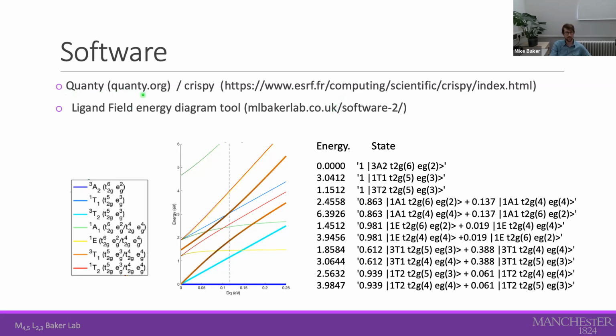I also showed some actual spectrum simulations which were conducted using Quanty, using the Crispy interface, and I advise you, if you're interested in simulating K pre-edges, L edges, or all kinds of X-ray absorption, emission, RIXS spectroscopy, then you check those out. That's all.